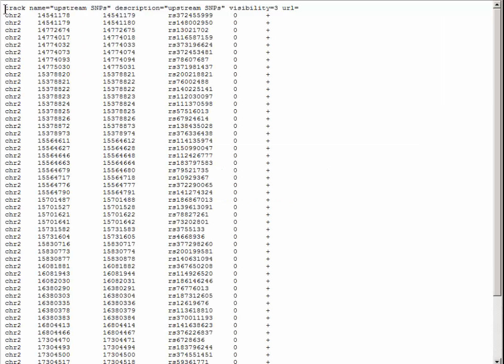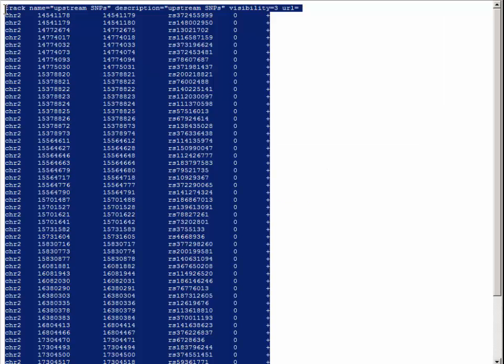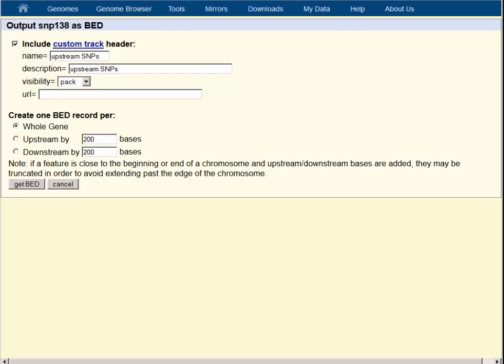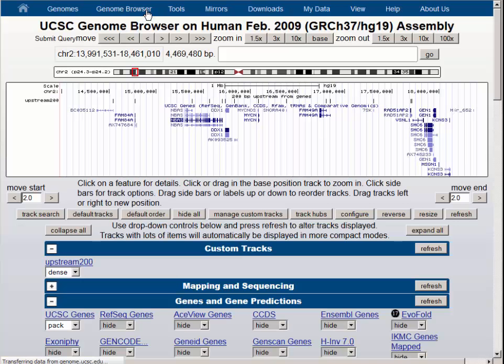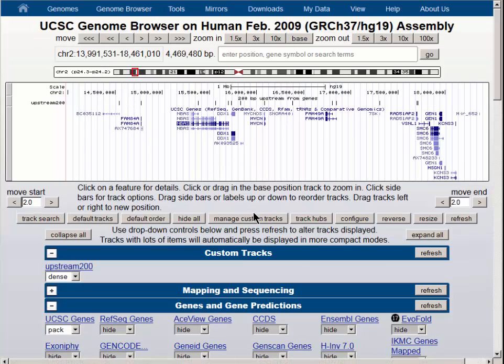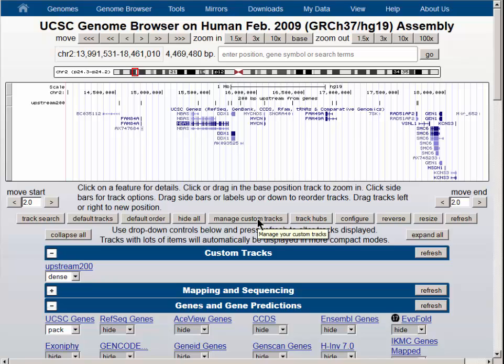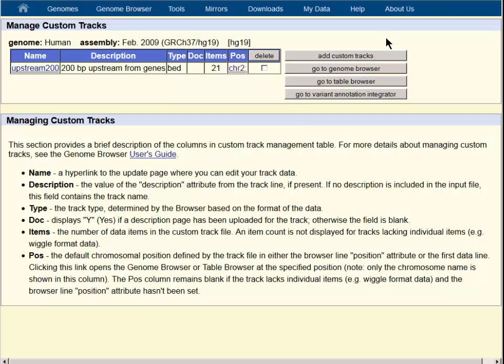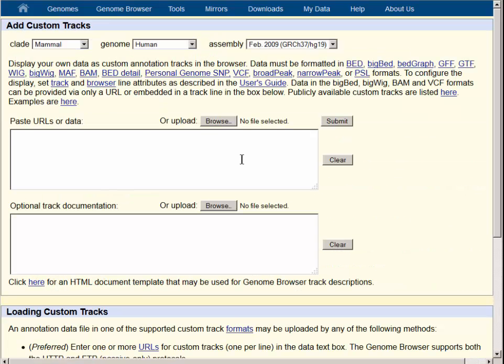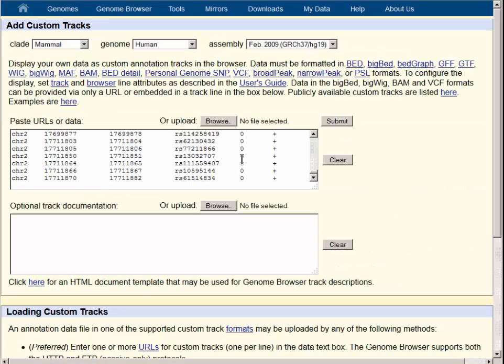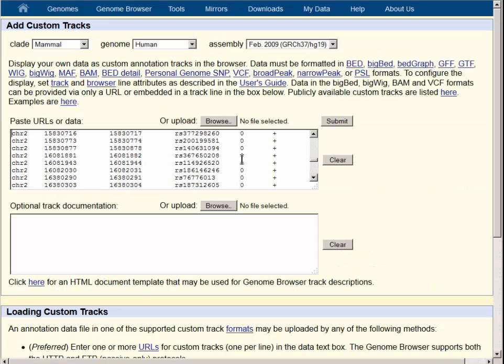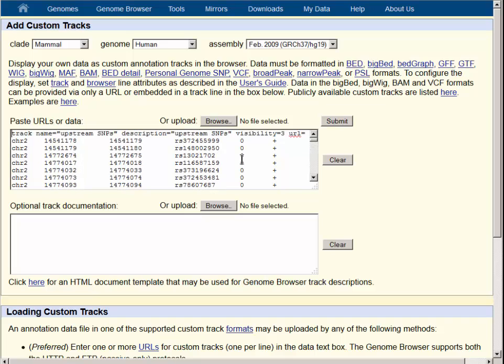Let's once again select all on this page and copy, and we will go back to the genome browser and load this page in as a custom track. Now you see that because we have a custom track, our button has changed from add custom tracks to manage custom tracks. We will click this button and then we have one more step to add custom tracks to get us back to the familiar page where we paste our content.